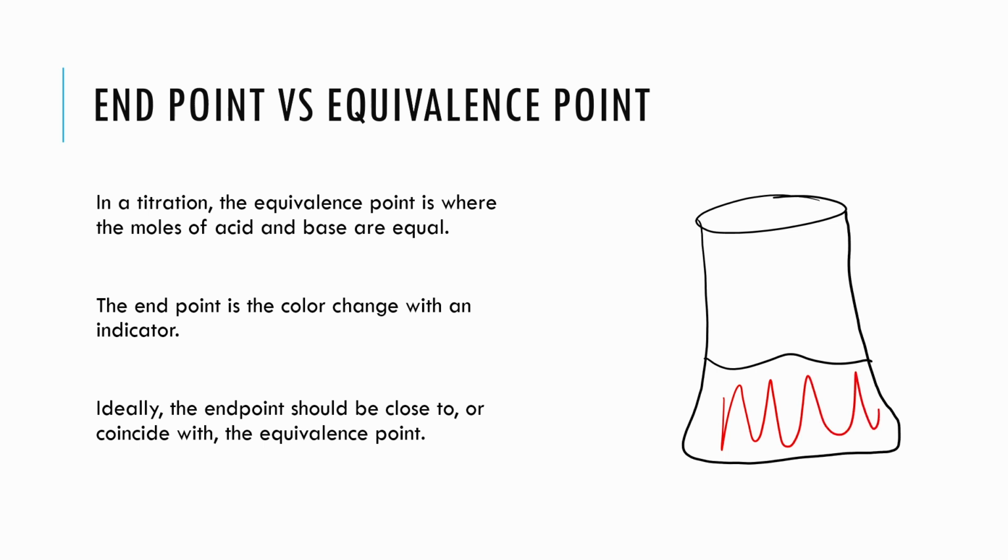When the color change occurs, we call that the endpoint. However, there is something else in titration called the equivalence point. And these aren't the same thing. Sometimes you'll hear them used interchangeably.